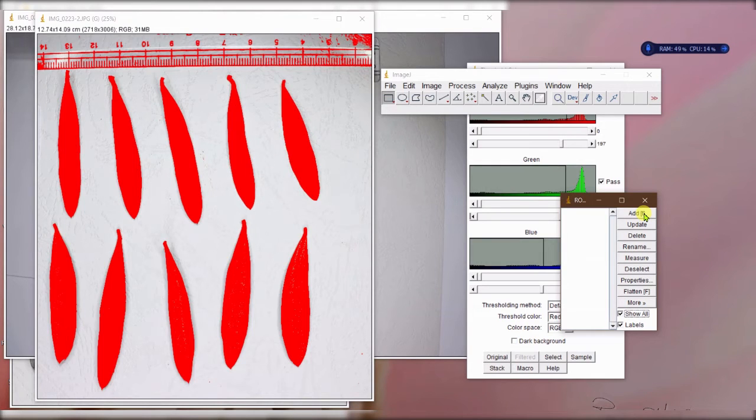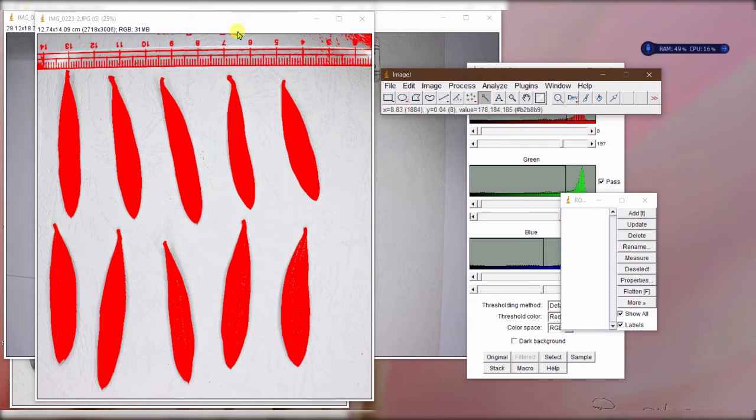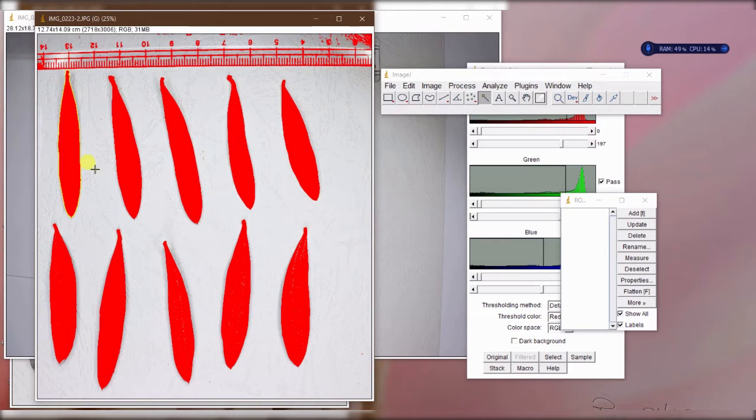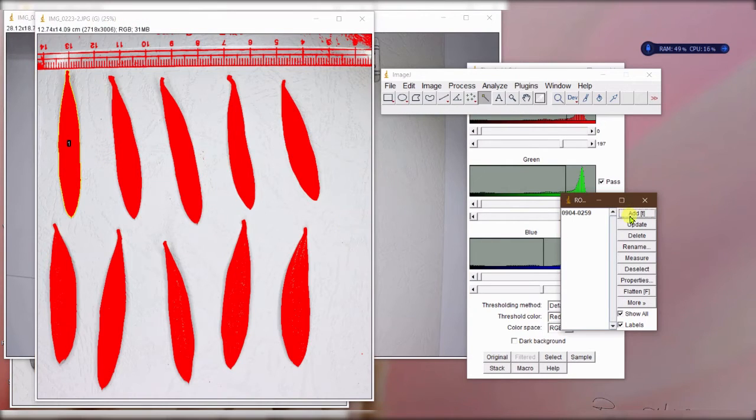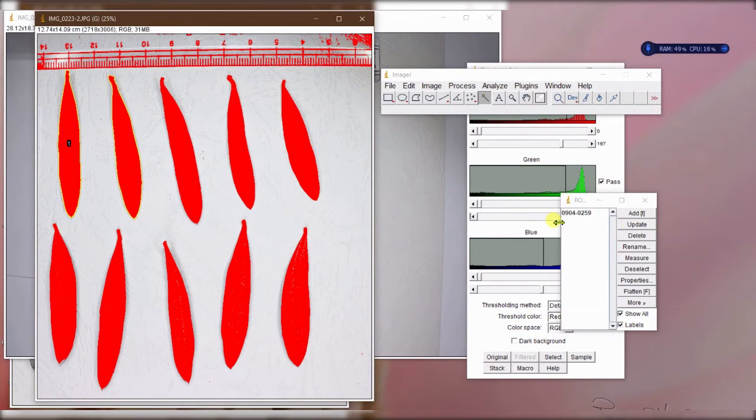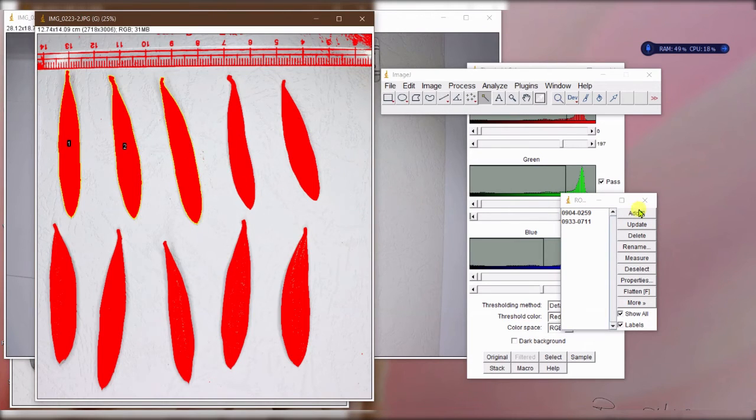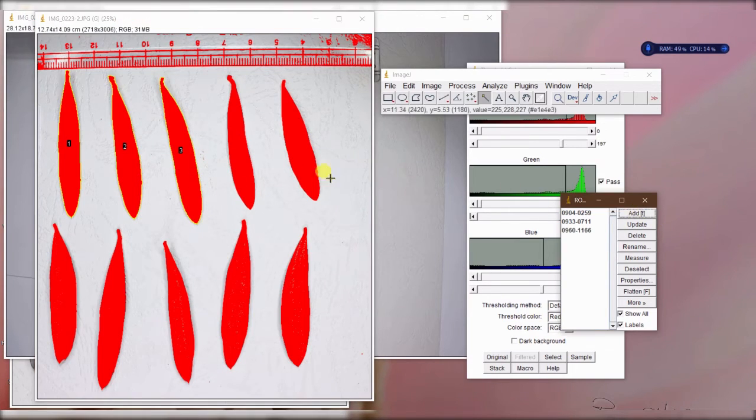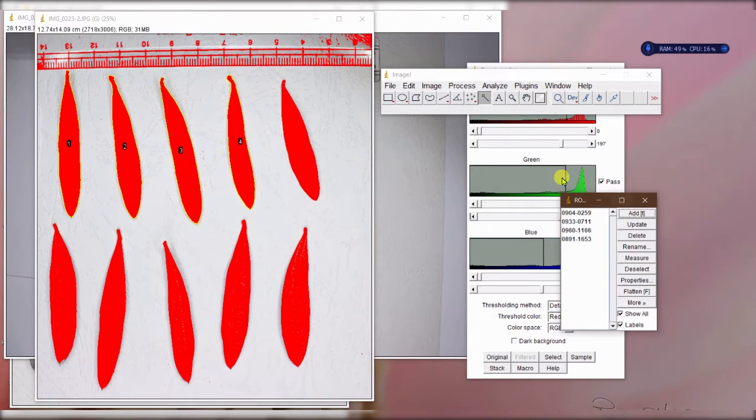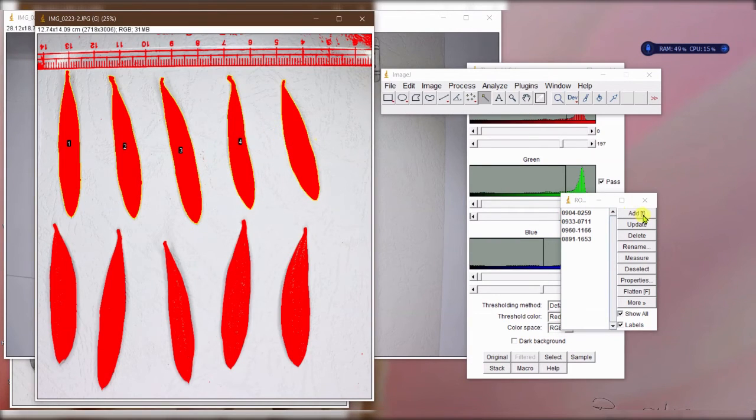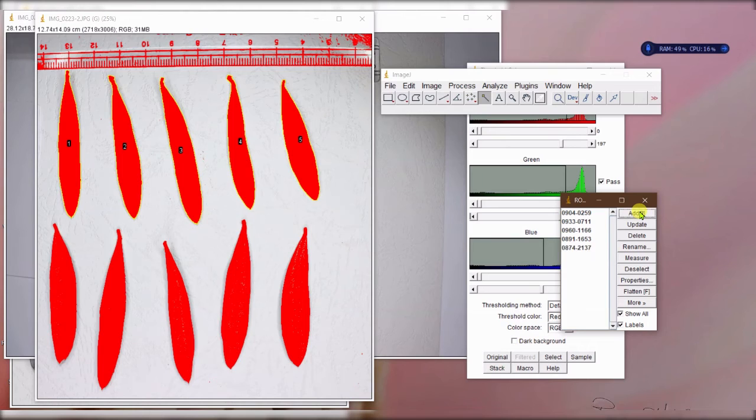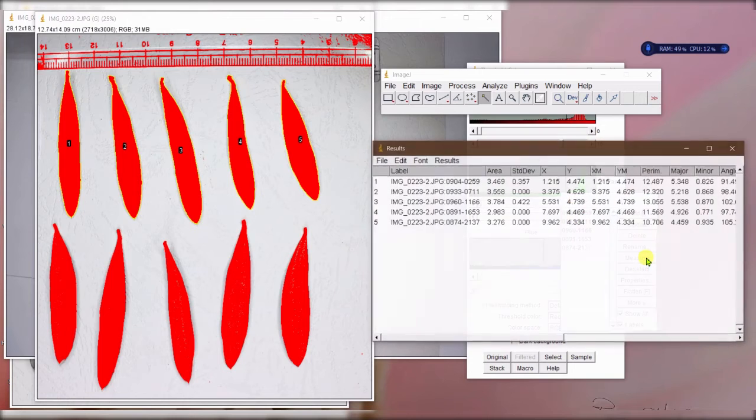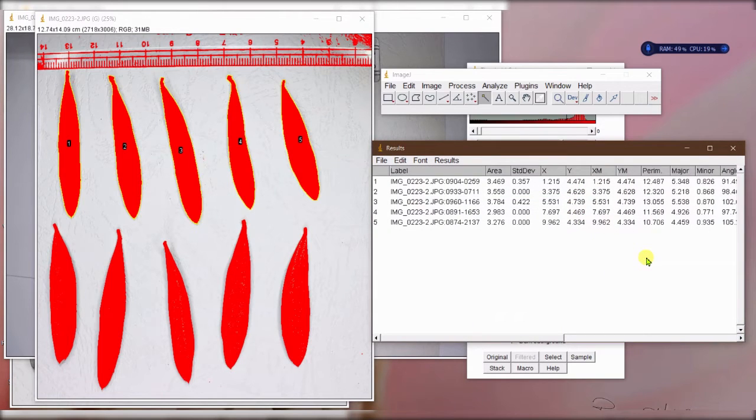You can go one by one because I don't want to include the ruler. So I can go one - here is number one - and then add it. You can see that now the number is there. Second one, third leaf, fourth leaf, and fifth leaf. The rest is the same. You just have to click measure.